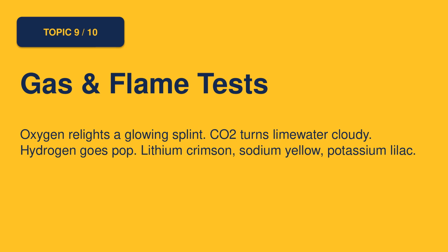Oxygen relights a glowing splint. Carbon dioxide turns lime water cloudy. Hydrogen goes pop. Lithium crimson, sodium yellow, potassium lilac.